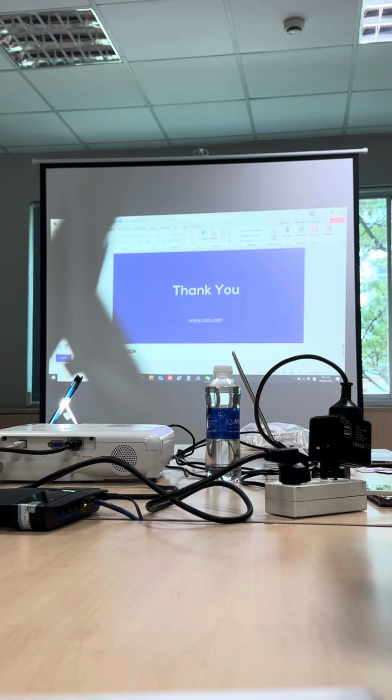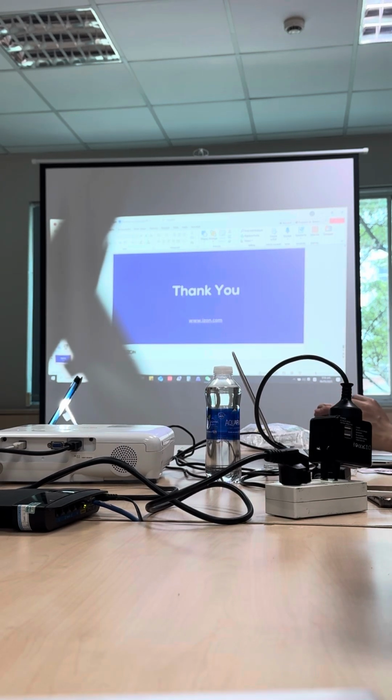Thank you. Basically, I need to emphasize that with TRPS, you need to wet the nanopore first, then measure the calibration, and then measure your sample. Between each step, you need to clean the nanopore. It's just slightly more steps compared with the optical method. With the optical method, you just prepare your sample, preset the settings, push it, and measure. But if the result is not accurate, even if it is very convenient, that makes no sense.